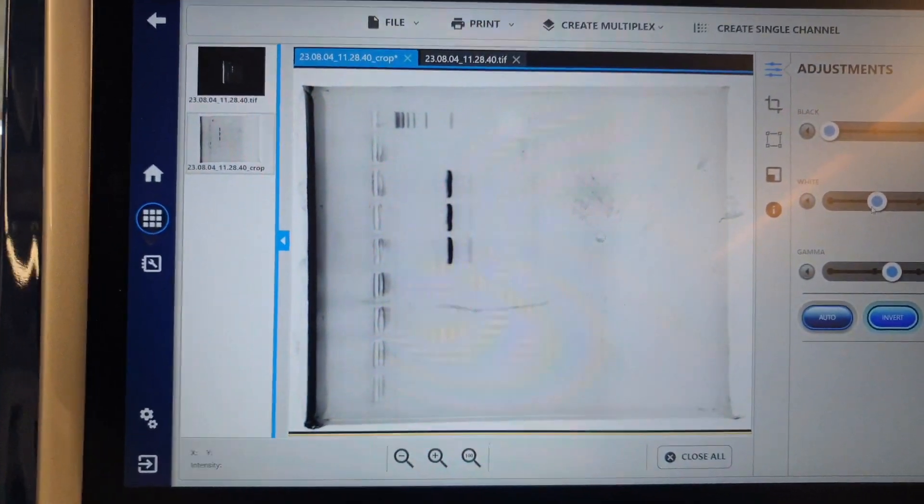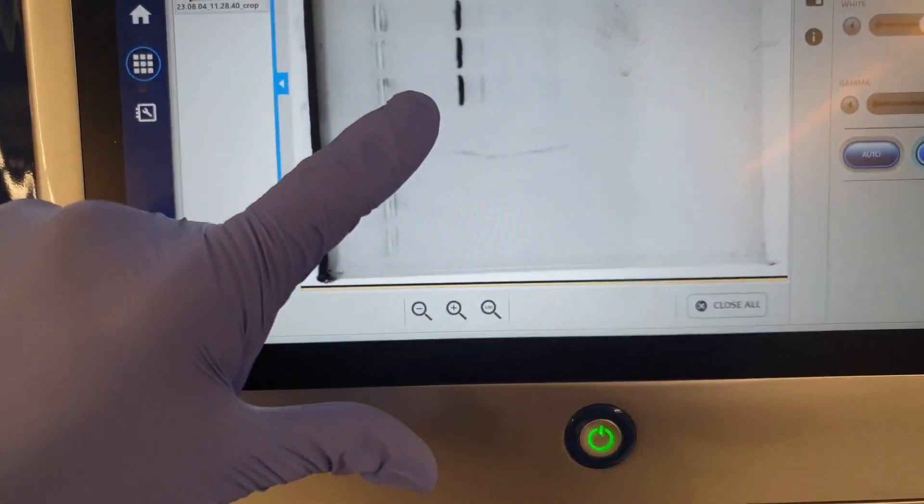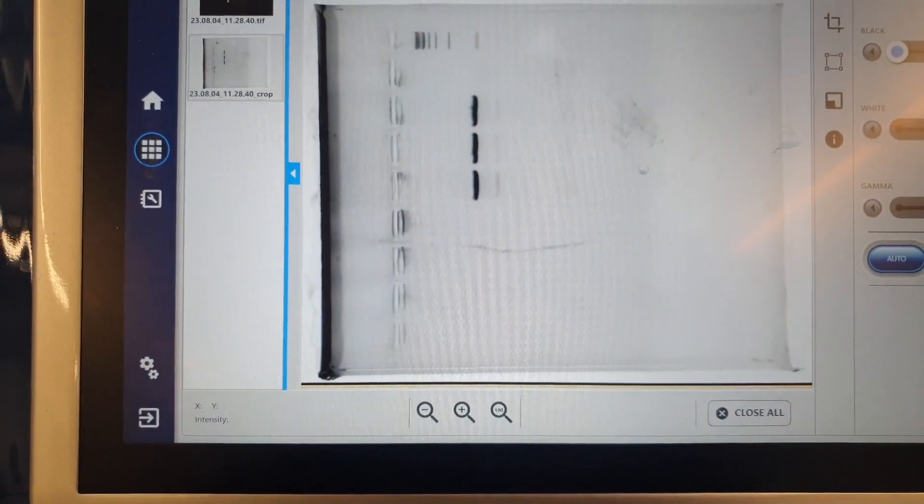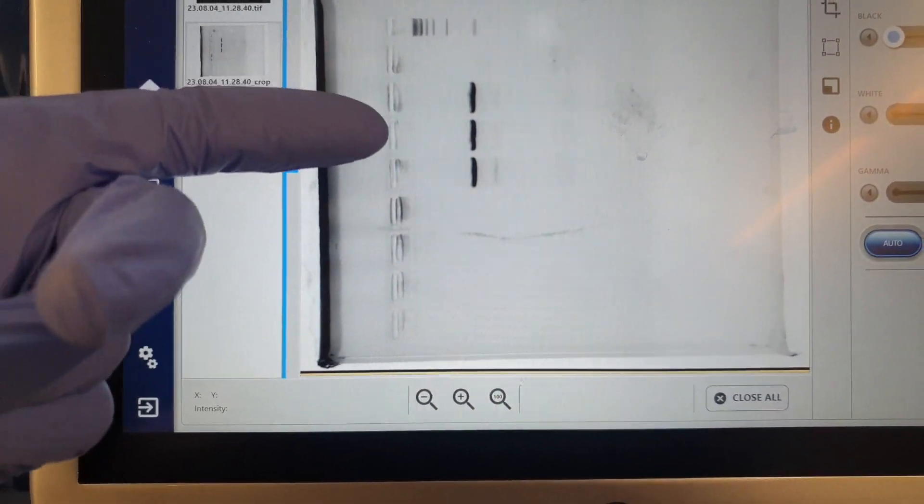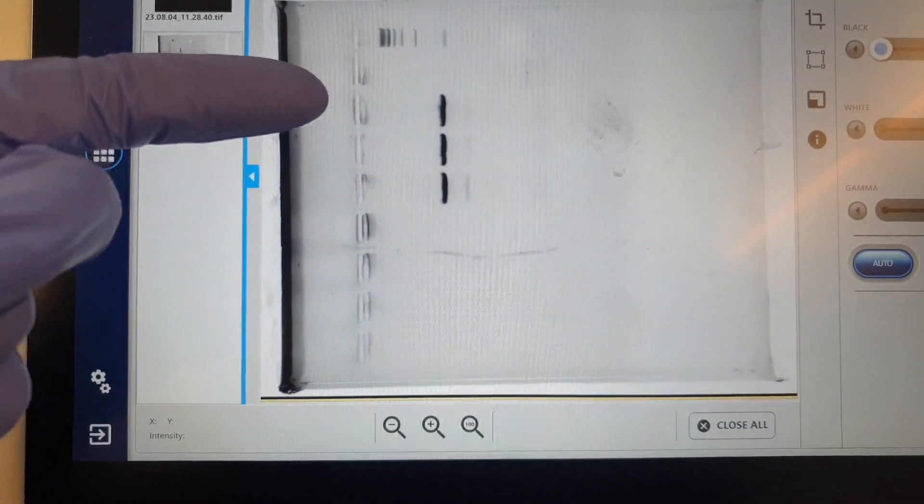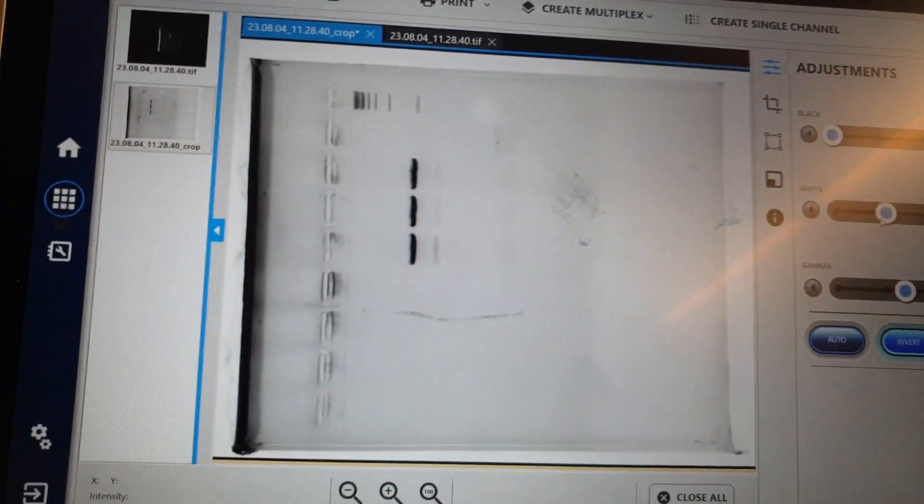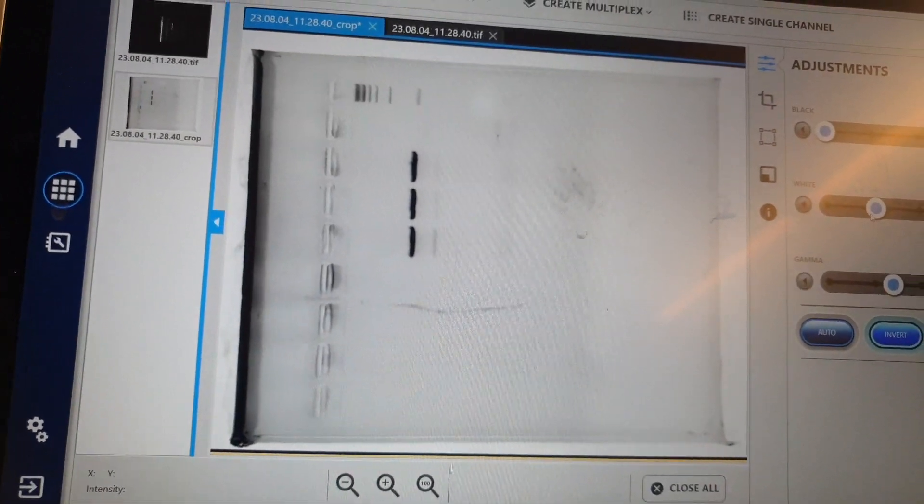And here are the results. As you can see, the first one was the one that was getting double bands. The second is the positive, the third one is the positive, and then the fourth one was the negative. It's a perfect example of how to use low temperature gelling agarose.